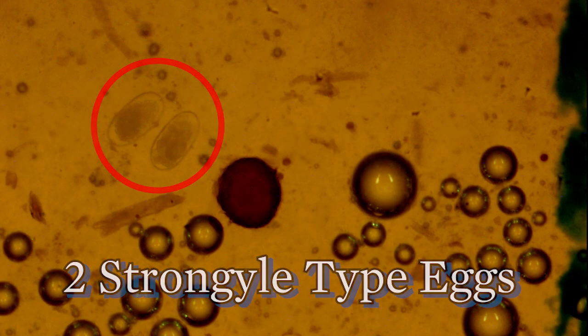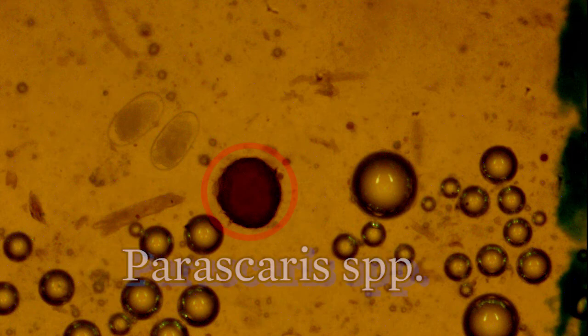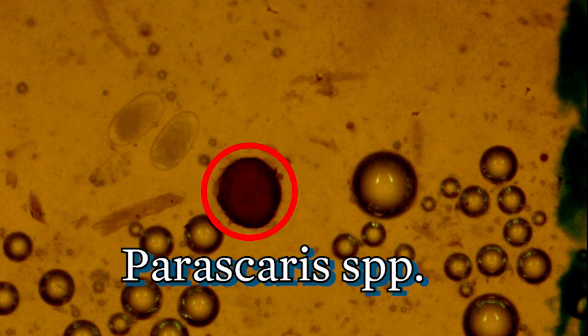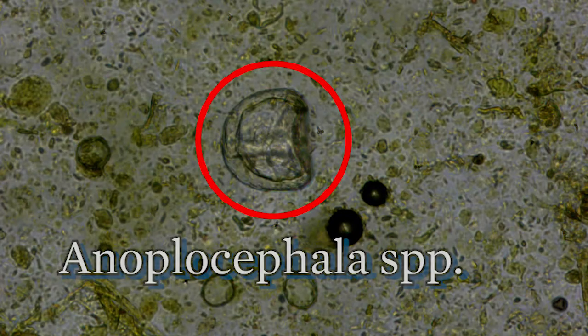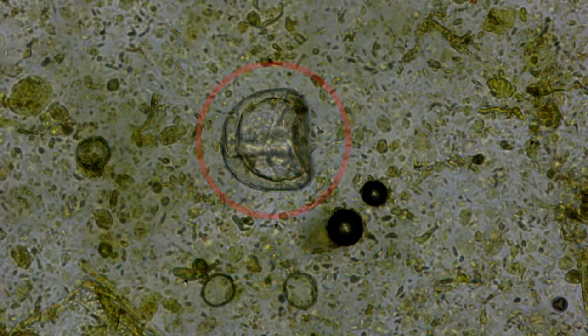We'll be looking for other types of eggs as well, such as our parascaris species or other roundworms, any tapeworms that we might see or any other eggs of interest.